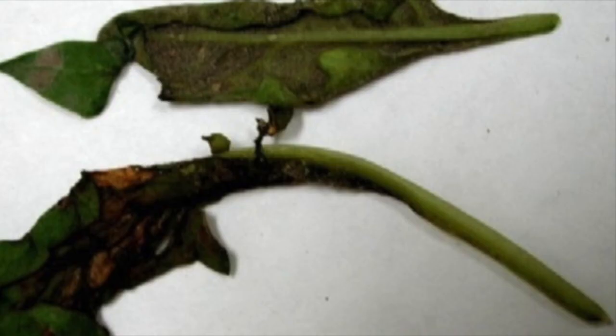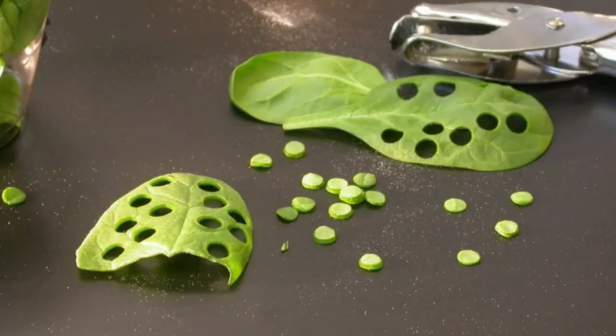From this experiment, there were multiple experimental errors. There is one which could have impacted the results heavily, so therefore should be addressed. The spinach leaves used had been sitting in the fridge for a long time before they were used in the experiment. One can tell this by feeling the texture. The leaves were soft, some even mushy and blackened at the edges, showing signs of denaturation. This could have impacted the results in many ways, as it was a struggle to punch them into circles, which could have damaged some leaves but not others.